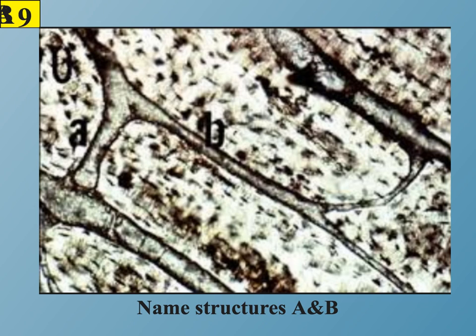If you are asked what is the type of this slide, it is a ground compact bone, because we don't see here any living cells, we are just seeing the calcified tissue. And we don't have a ground slide for the spongy bone, as it is very fragile and friable and will not be available to us to produce a ground section.